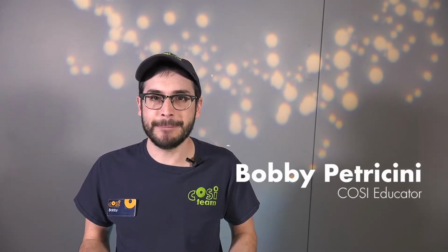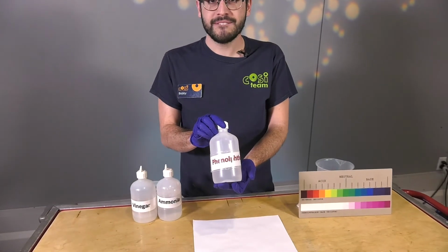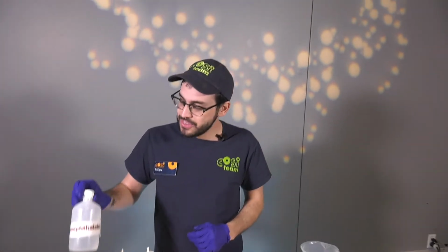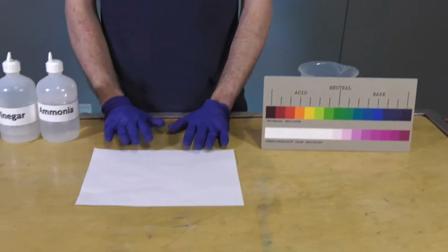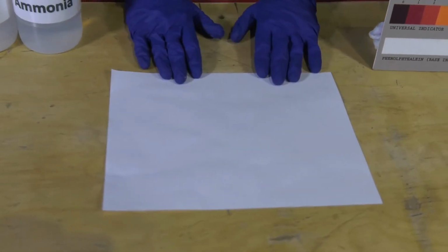Today we're going to be talking all about something called a base indicator. So today we're working with a chemical called phenolphthalein, a really nice long word, and what it means is that this is going to show us when a base is present. So what we did here, I went ahead and wrote a secret message on this paper here in phenolphthalein, and we're going to see if we can bring it back.